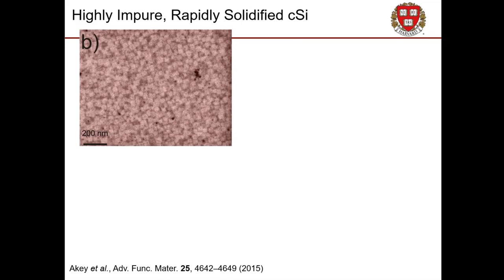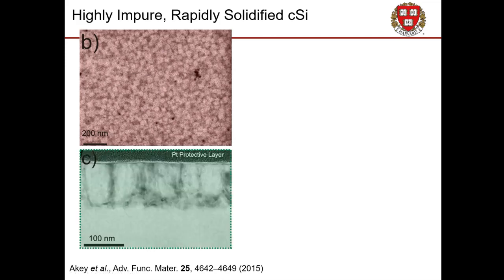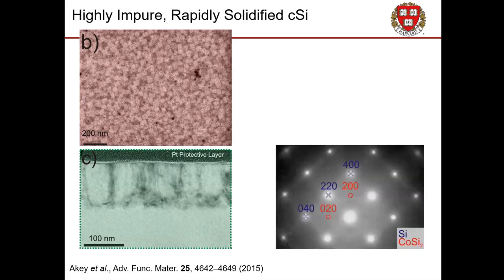And on the surface, in SEM, we can see it forms a very strange square texture, which was not well understood. It was assigned the term cellular breakdown. And in cross-section, in TEM, there are these pseudo-linear structures with lots of little blobs around them within about the top 140 nanometers of this, which are presumed to be segregation regions of the impurity.